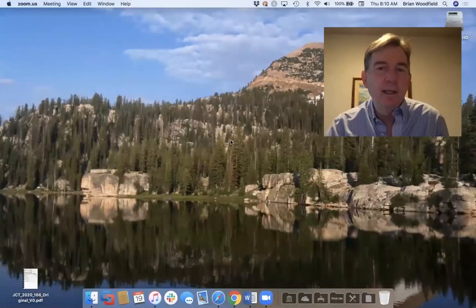So I'm going to go through and kind of show you the lab. The first thing I'm going to do is show you kind of how the client works and what's in the client. That's kind of the one hurdle that students get over, and maybe only 5%, 10% of the students do, and then show you what those labs are.